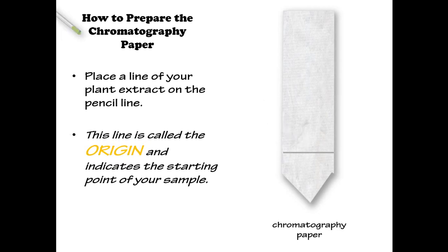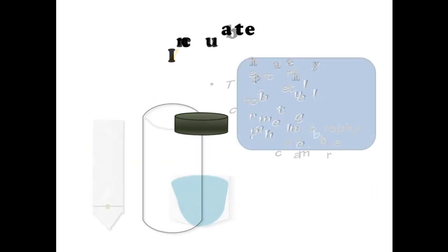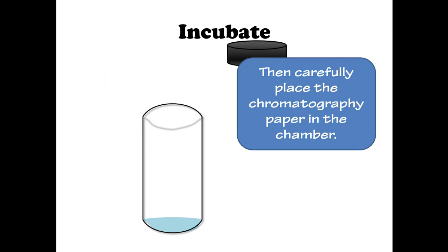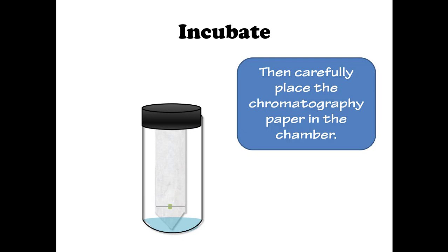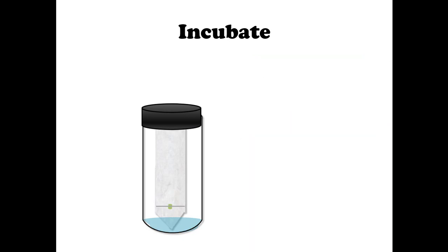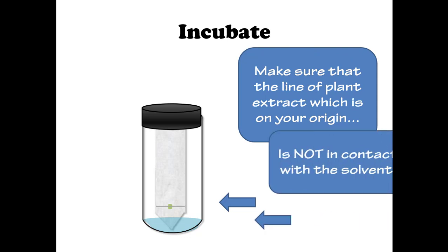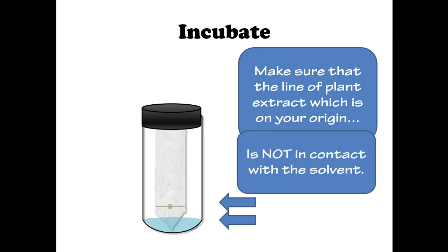Next, place a line of plant extract on the pencil line. This line is called the origin and indicates the starting point of your sample. Then carefully place the chromatography paper in the chamber, making sure that the line of plant extract at the origin is not in contact with the solvent.